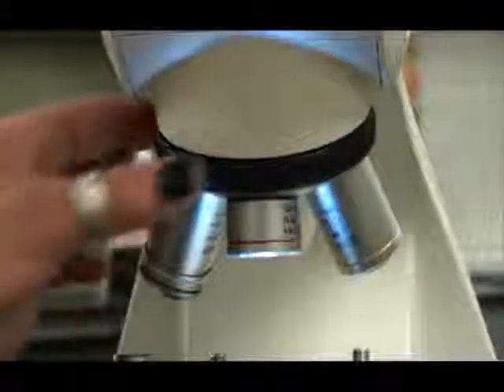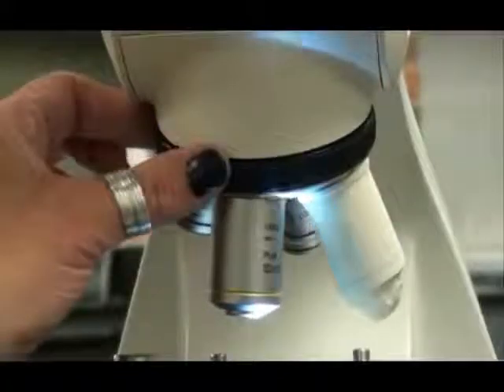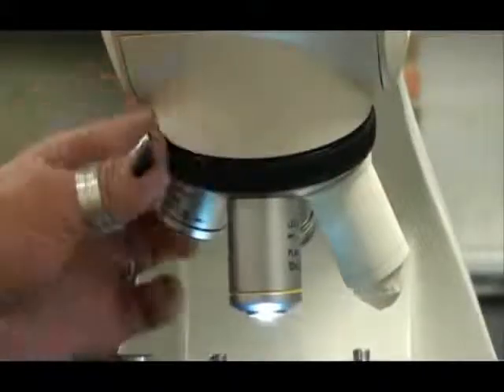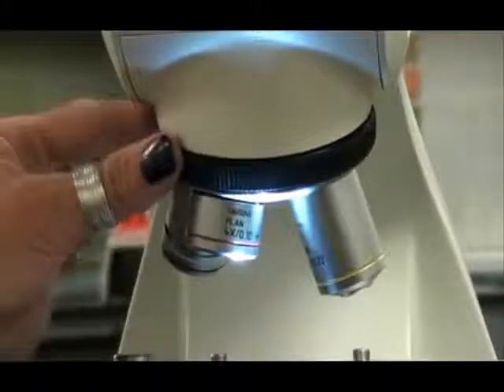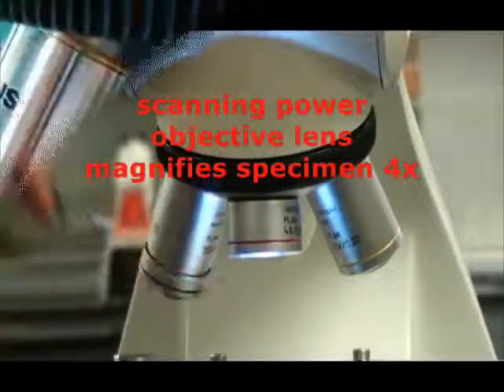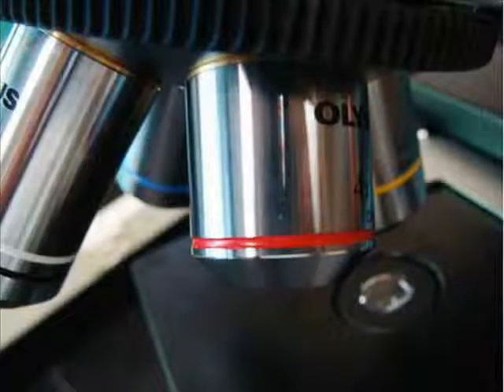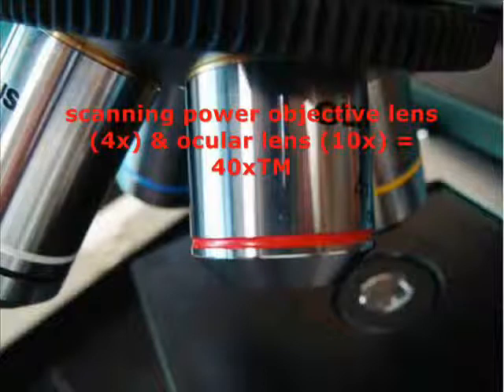The objective lenses are located on a rotating nose piece. Each lens hangs down from this nose piece and can be turned and clicked into position. The shortest objective lens is called the scanning power. It has a red band around it and magnifies the specimen 4 times actual size. Since you're always looking through both the ocular and the objective, you multiply the powers together to get total magnification — 10 times ocular multiplied by 4 times scanning gives a total magnification of 40 times actual size.